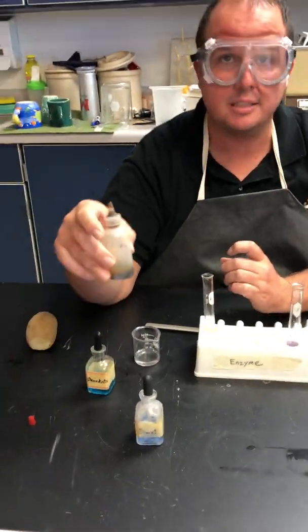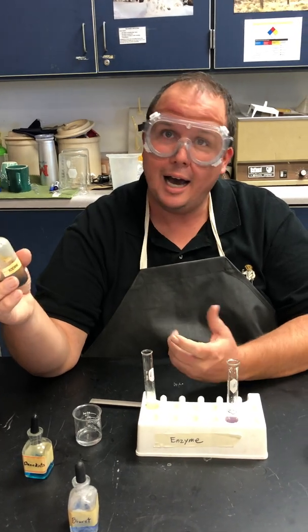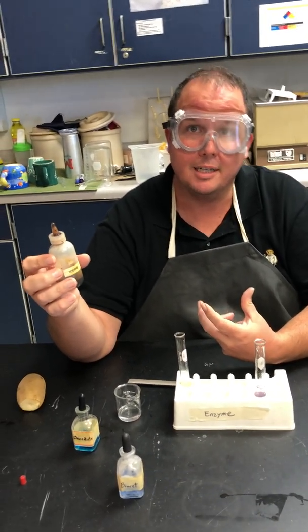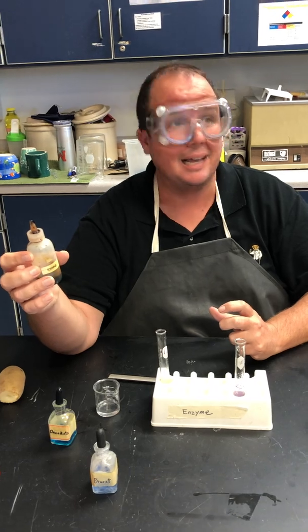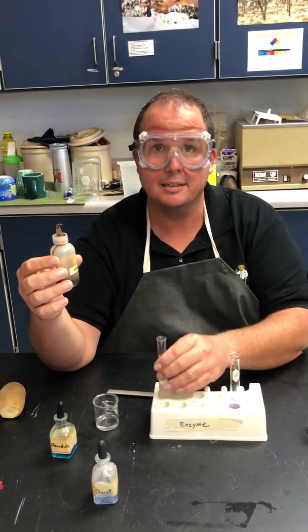Next, we're going to test for starch using iodine. You may have seen iodine used in the hospital if you've gotten a cut, because it's a really good sanitizer. My wife cut her foot once and they put her whole foot in iodine. It hurt, but it cleaned it out. Yep, iodine's a really good antiseptic. It kills bacteria.